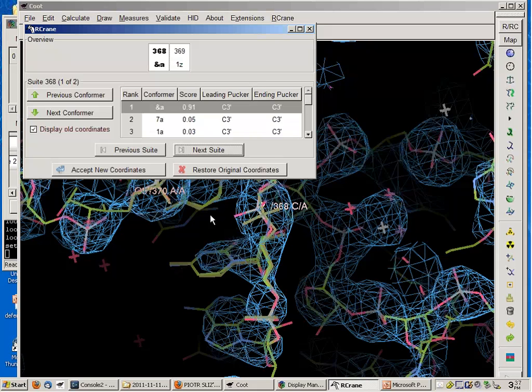Part of the problem with doing a switch later is it's going to try to reposition all the bases, and so there's no easy way in RCrane to go back and fix it if it guesses wrong for how to reposition those bases. So right now, if you realize 3 nucleotides in that you are tracing in the wrong direction, you have to go back 2 nucleotides and then click the switch button and then retrace the other 3.